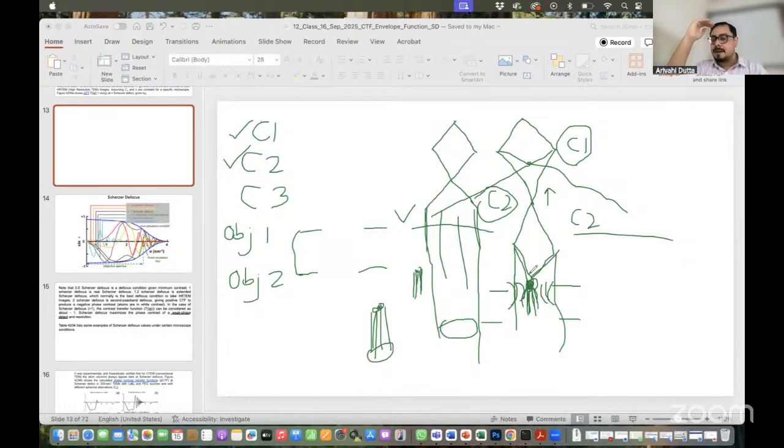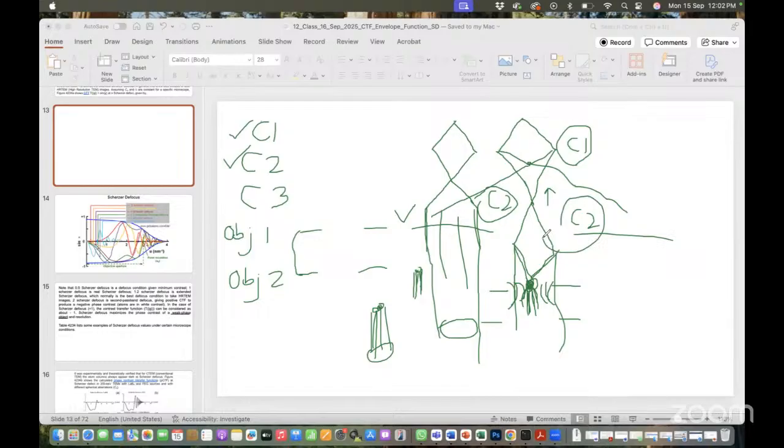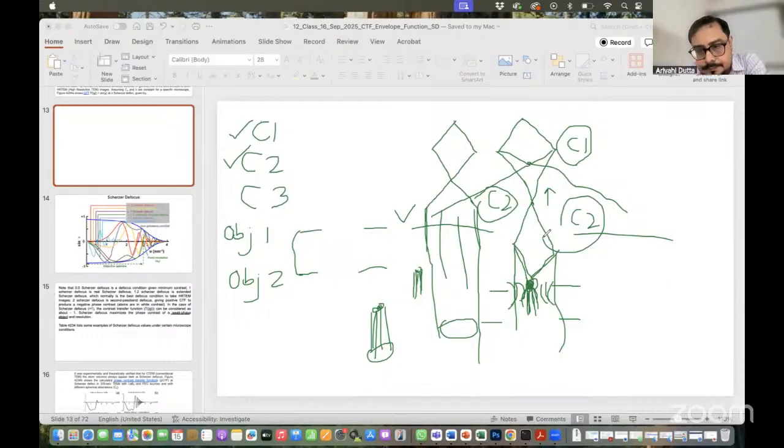The C1 and C2 lenses help determine where your electron beam will converge. Is it just above the sample? On the sample? Below the sample? Or a little bit far away from the sample? That is basically controlled by your C2 lens. So we keep adjusting the strength. When we do low dose imaging, we want a strong C1 lens and we apply a weak field strength on the C2 lens. Yes.